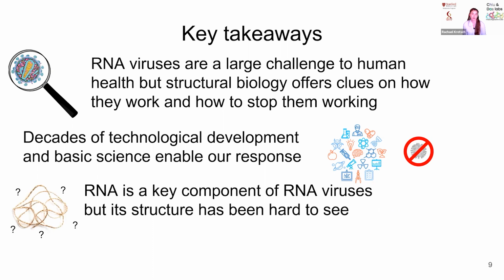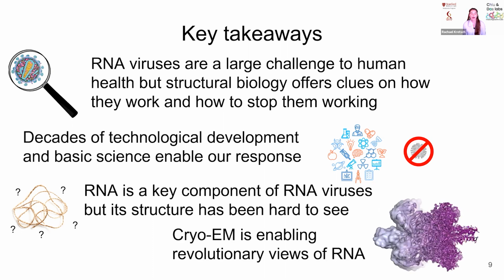RNA is a key component of these RNA viruses, but its structure has remained a mystery for much of history. And then Cryo-EM is finally enabling us to actually look at these RNAs.